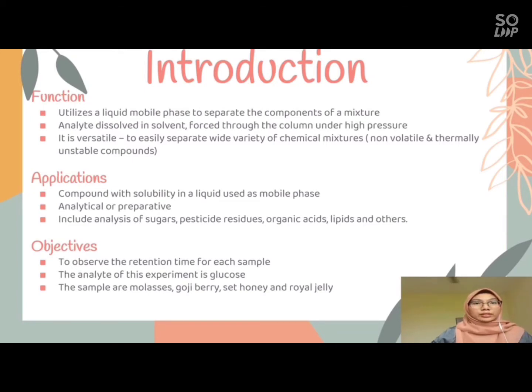For the applications, any compound with solubility in a liquid that can be used as a mobile phase, analytical or preparative. It is a highly purified compound in small or large quantities.